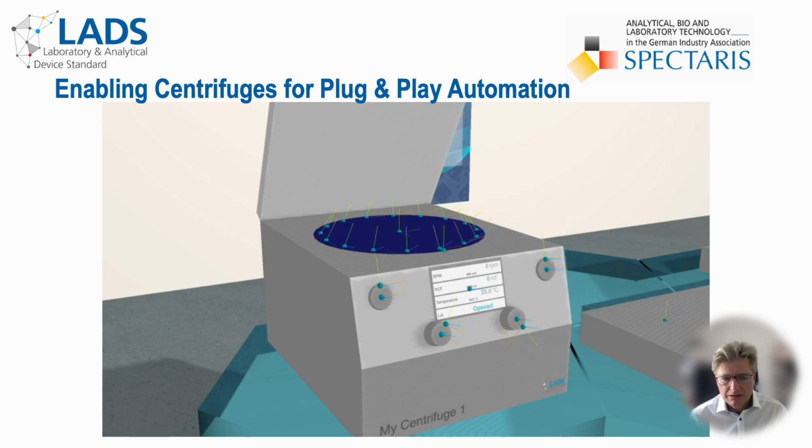Please note that the positions are inclined with respect to the rotor's vertical axis. This is very important information whenever a robot wants to place or pick a labware like a conical vial in the rotor. Whenever stopped, the rotor itself can be oriented in any angle to the centrifuge's cabinet. This is illustrated by the additional attachment points on the outer circumference of the rotor, which is intended to serve as index mark.